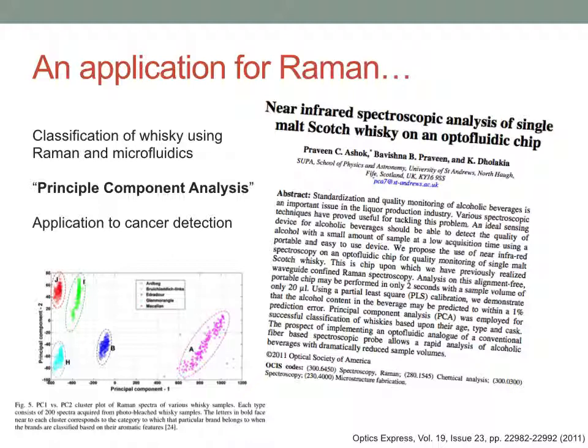We might know what we're looking for with infrared, but we can't see it because of the water, and drying it down, and all the other stuff that's in there as well. We just can't see what we want to be looking for with infrared. So Raman is a fantastic technique, and this is quite a fun kind of paper. I always like a fun paper for Christmas.